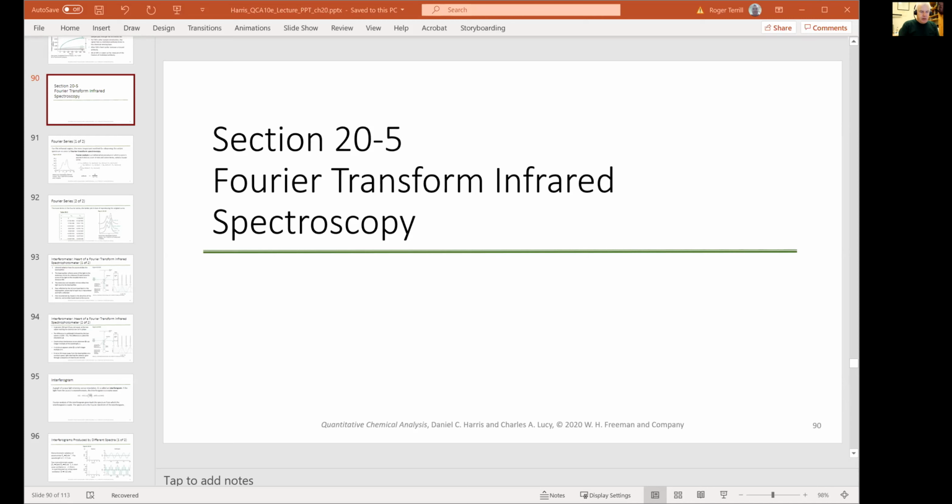But I think there were a lot of clever folks out there who realized that you could do much, much better by using an interferometer. And an interferometer, it's just a box. What the box will do is modulate the light that you put into it.